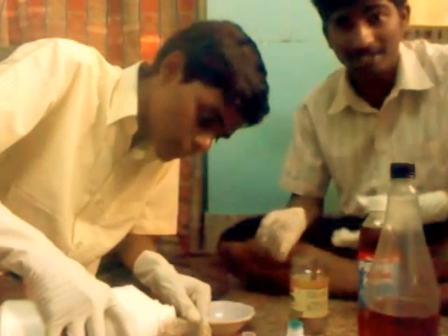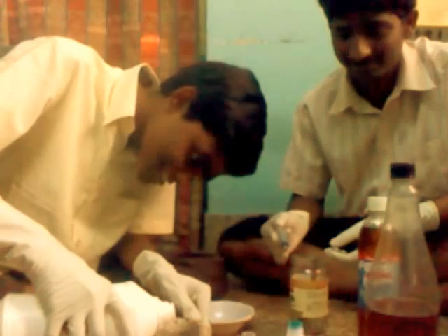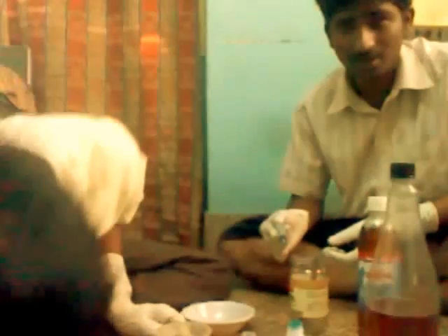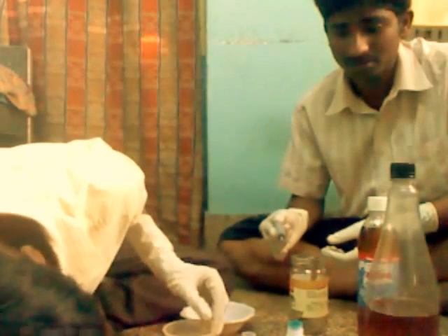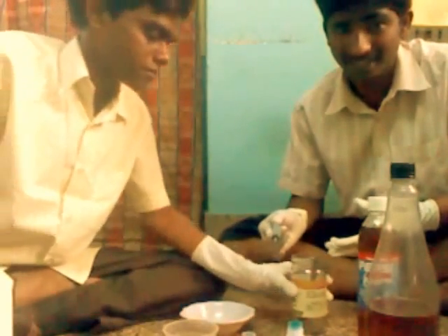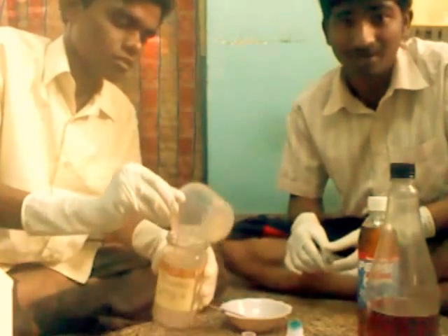We have to be very careful while doing this experiment. Care should be taken while measuring sufficient quantities, otherwise it will cause abnormal reactions.